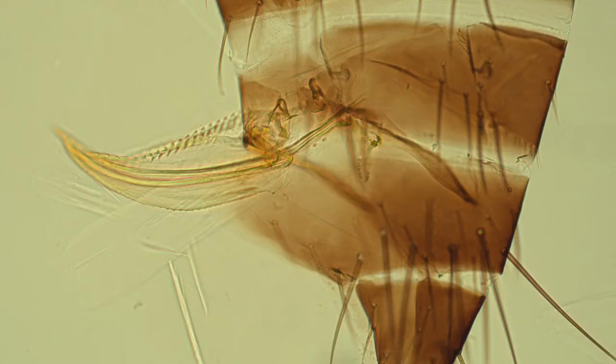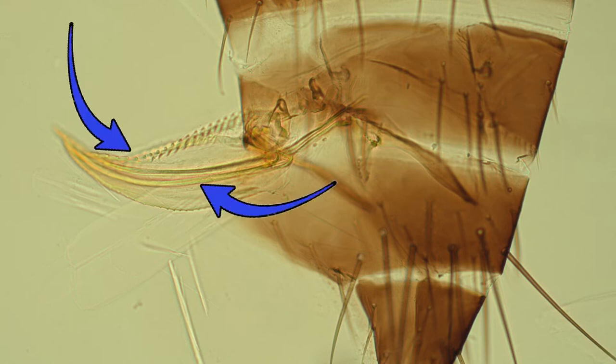Next, we'll take a look at the tip of the abdomen on the female specifically. This is where the egg-laying device is, called the ovipositor. You can see here that there are actually two different saw-like blades that they use to cut into the plant tissue. So just like their feeding mouthparts, this is another way that they're going to be damaging the plant tissue, and you'll be seeing these negative effects on your peonies.